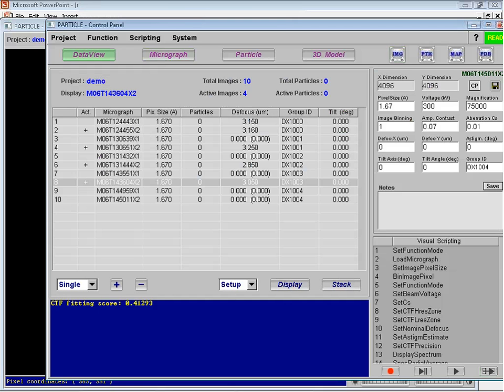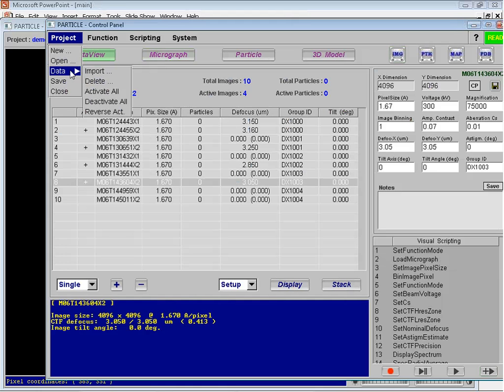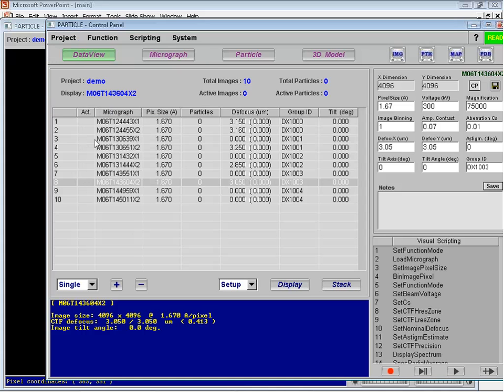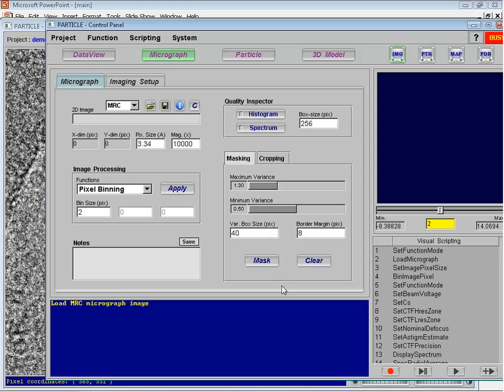And here, the visual scripting has completed. And as you can see, for these 4 images, now we have the CTF images. Okay. So the second demonstration is on the serial image registration. Feel free to interrupt if any questions come in. So here, I'm thinking just to demonstrate this with 1 image series. If I load the original image, it has a really poor contrast.